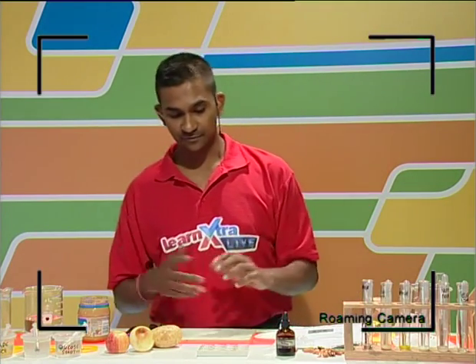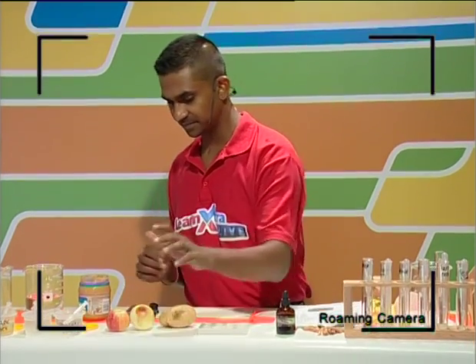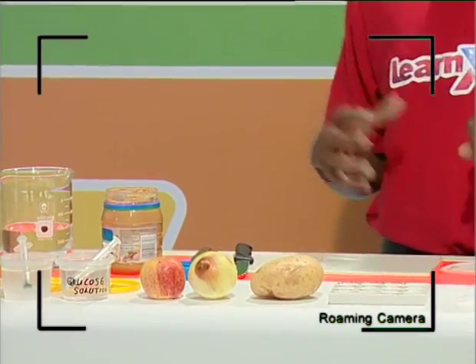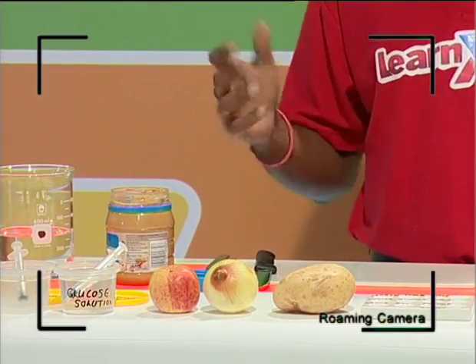So what I have in front of me today is a few different foods: potatoes, and we've got some onions, and we've got apples, and again we've got some of your favorite peanut butter, and you know why it's good. We're going to test to see whether these food samples contain starch.